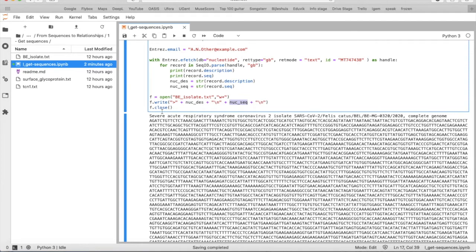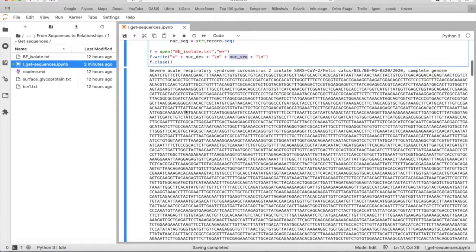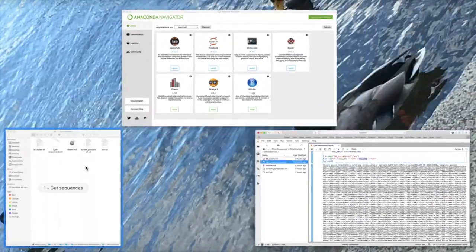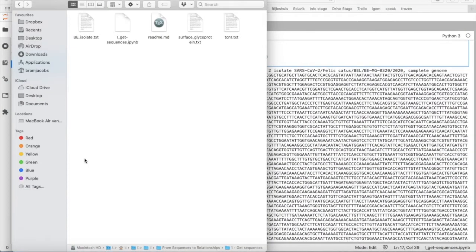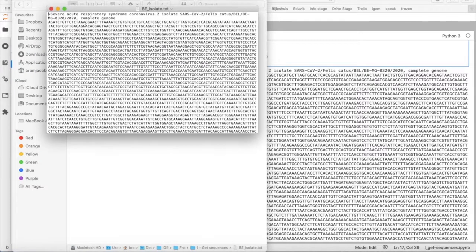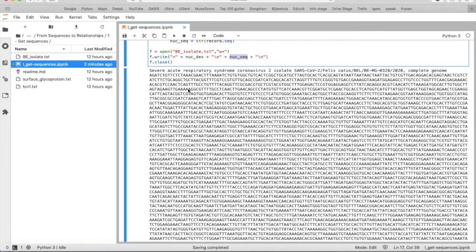And then we say f.close to close the txt file and then there will appear a new file in your folder and that will be the BE isolate.txt and this is exactly what is here.